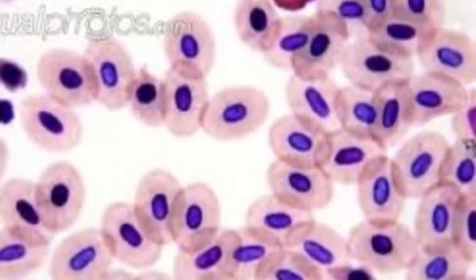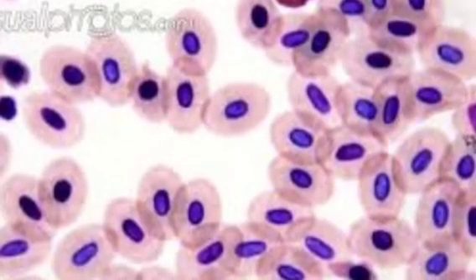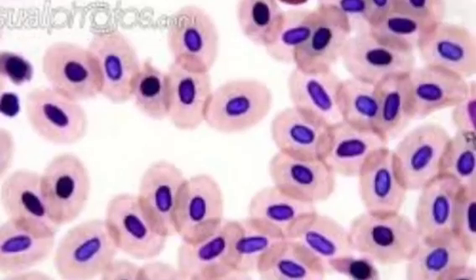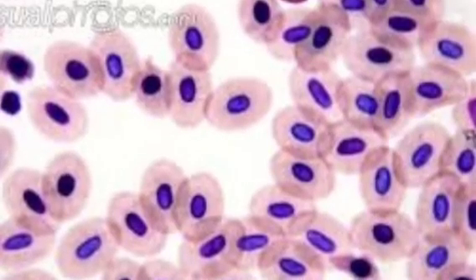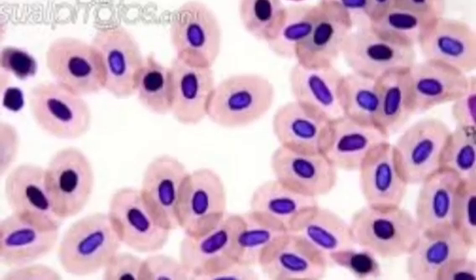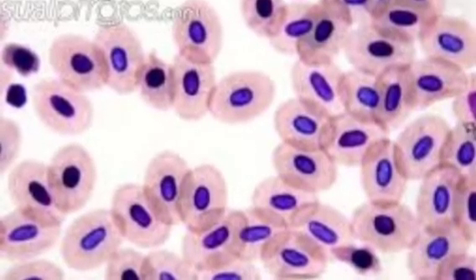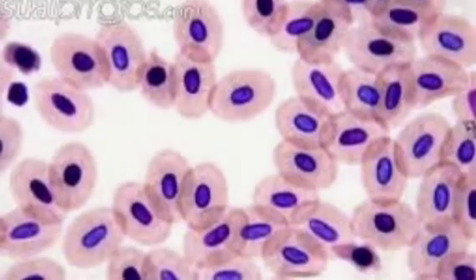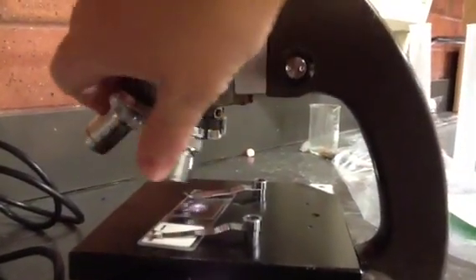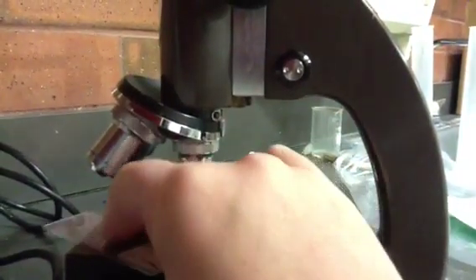This image is using the high power lens. This image is being magnified 400 times. Notice you've lost quite a bit of the picture, but you've gained a lot of detail. You can now see that these look somewhat like eggs rather than just dots. When finished with the high power, rotate the lenses back to the low power and remove your slide.